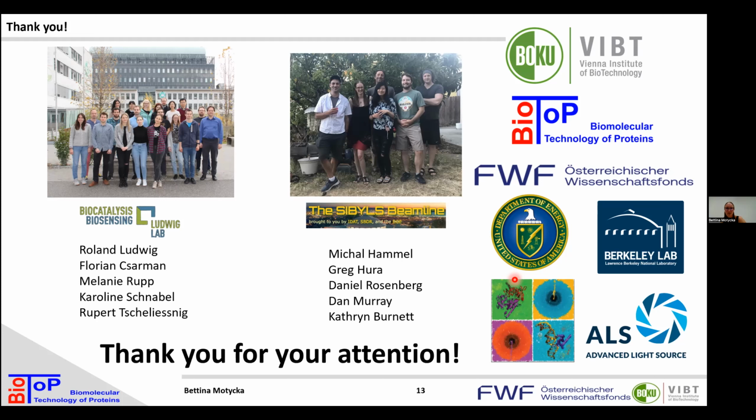Yeah, with this, Michael was busy, because we used first this BilboMD and it didn't work out, and then we used BilboMD2. And then Michael had to do some more programming, especially for the Heme B cofactor, but it's working now. So anybody else who has problems with cofactors now has the tool to do it.